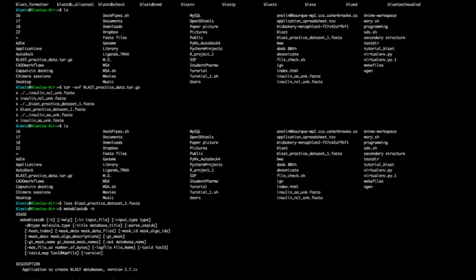So with the options set, you can copy-paste parameters. If you have a mouse, use the middle scroll button to paste. We run makeblastdb with our input file and set the output to 'BLAST_DB'. Now I need to specify the database type — since these are amino acid sequences, I'll write 'prot'.